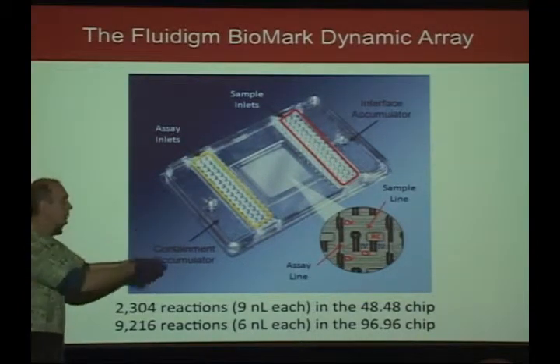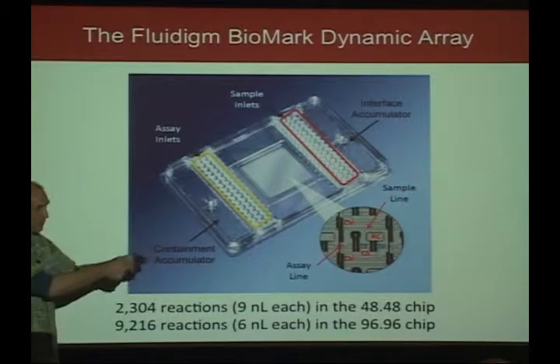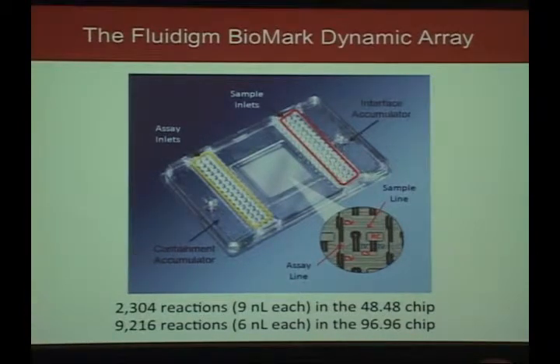And then you take it out of there and you put it into the cycler part of the instrument, where it then carries out all the qPCR and reads out the fluorescence.